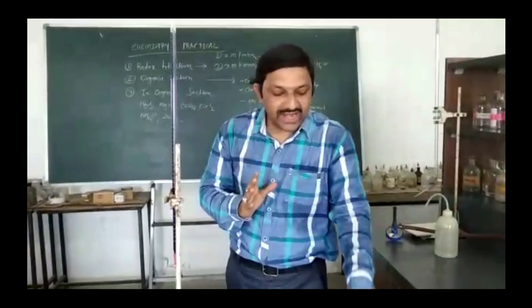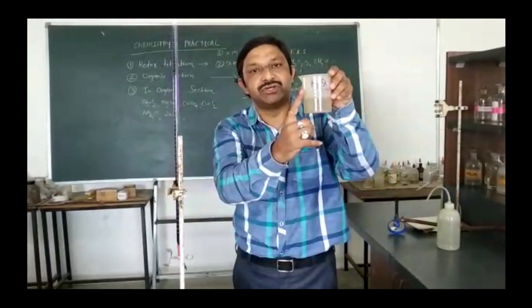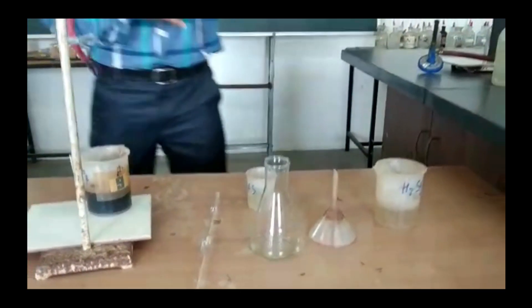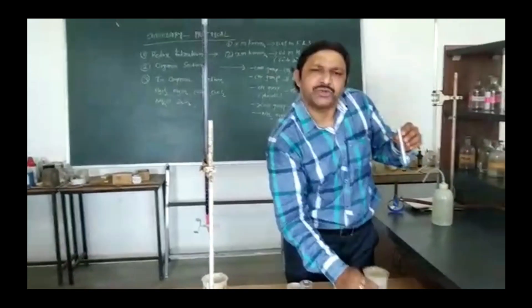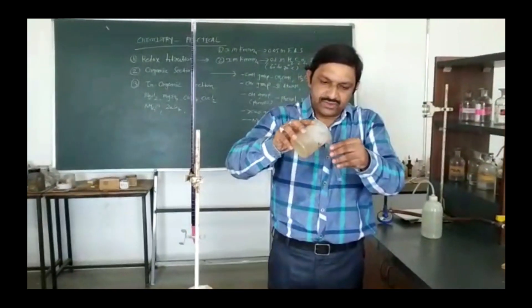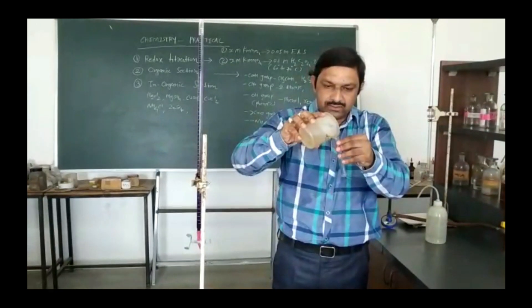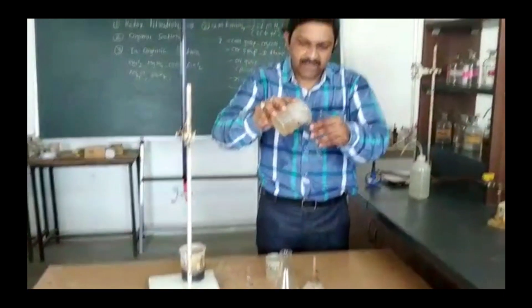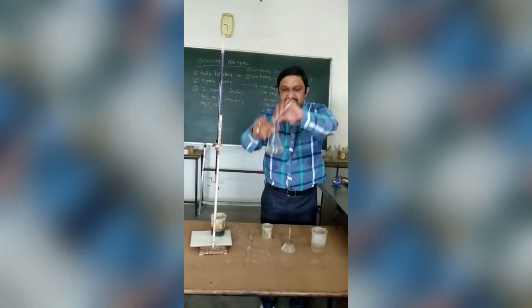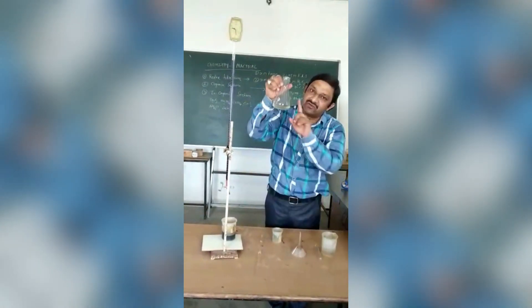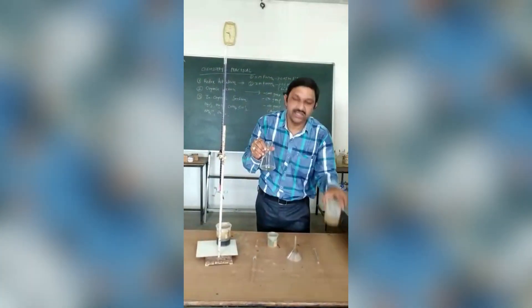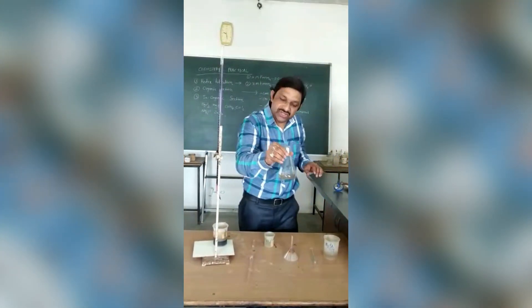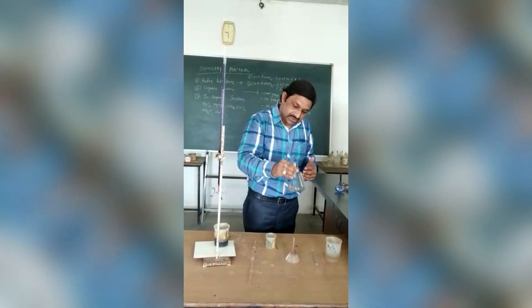Next step: you have to add dilute sulphuric acid solution. You have to take one and a half test tubes — one into your conical flask and half more is enough. So here is your ferrous ammonium sulphate solution plus dilute sulphuric acid solution. Stir your solution first.